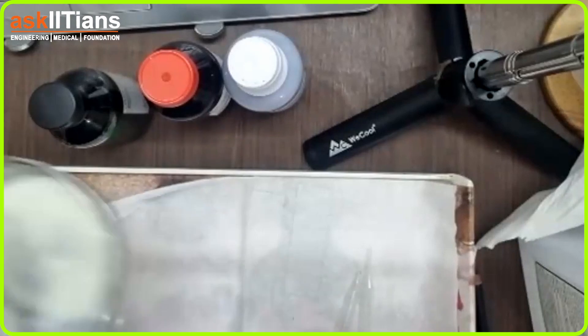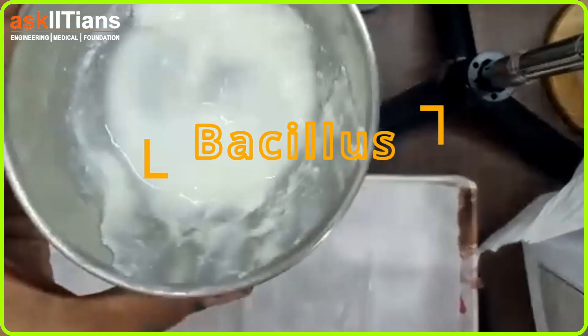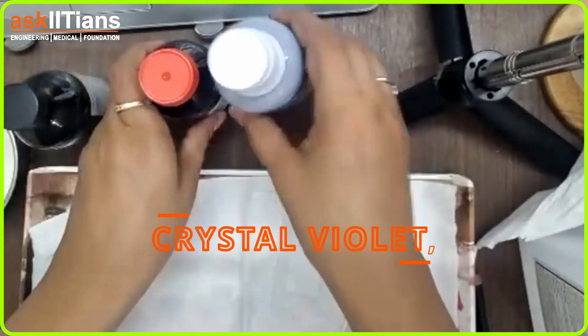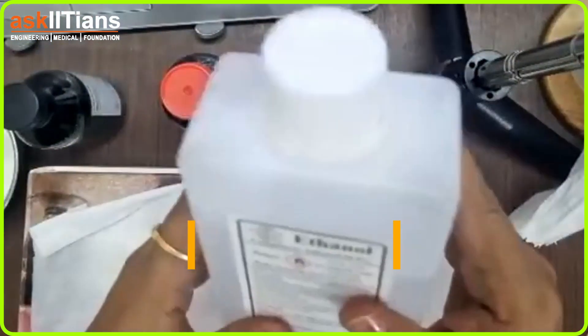We have a curd sample which is Lactobacillus, and we will see if it is gram positive or gram negative. We have an iodine sample, crystal violet dye, safranin dye, and alcohol that we will be using.